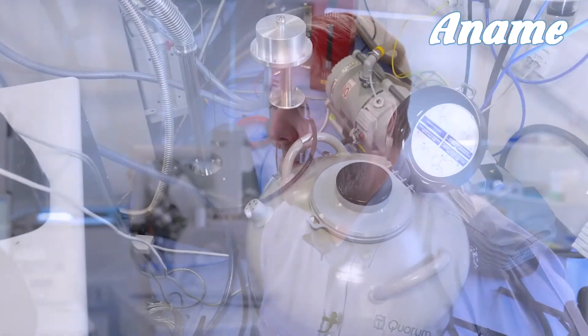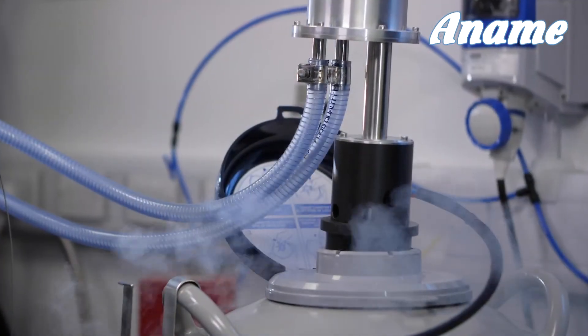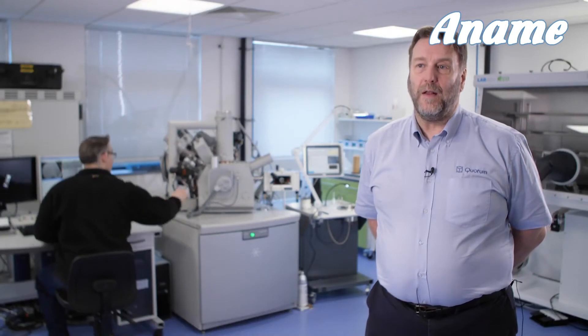Because the system is running with an off-column dewar — which in the latest incarnation is a 30-litre dewar — it means we can run 24 hours at least at normal working temperatures without refilling any liquid nitrogen at all. The vacuum isolation is extremely efficient and we do not see any icing or frosting on any part of the system in normal operation. By refilling the dewar you can actually run for several days — in fact we have customers who run for four and a half days during a cryo-FIB session.